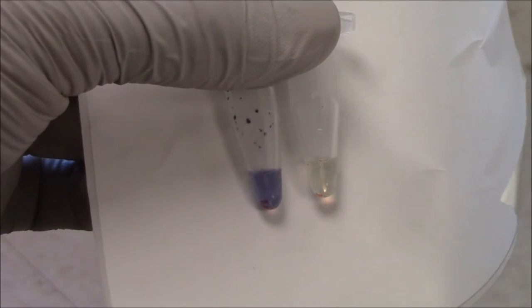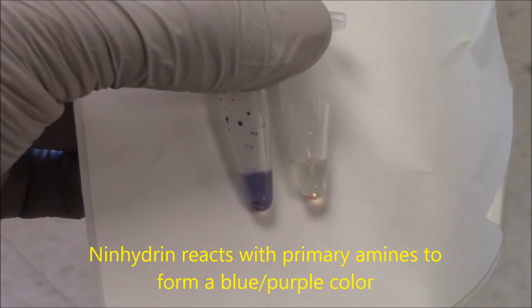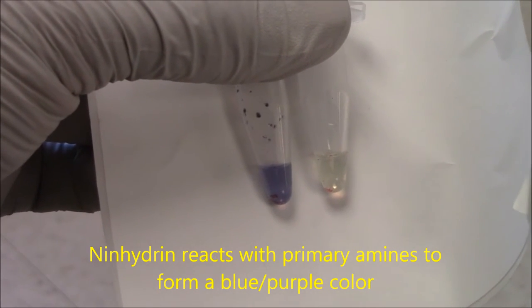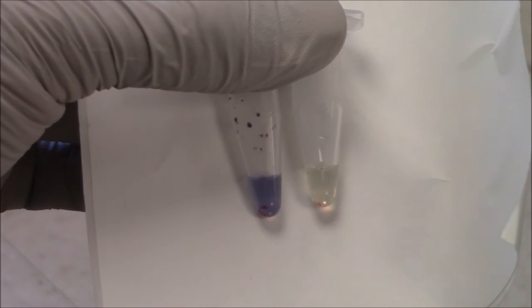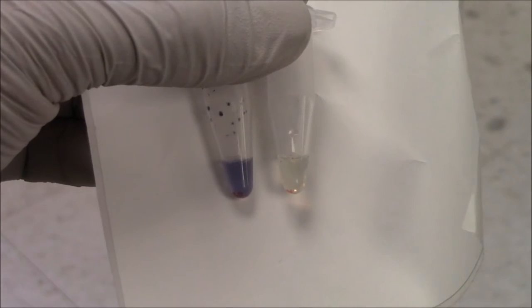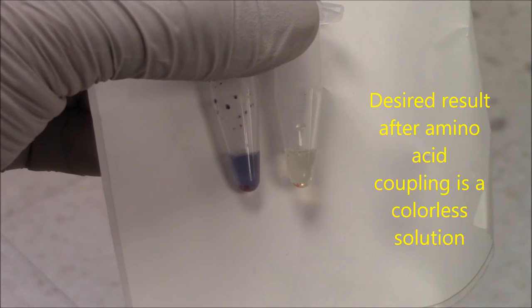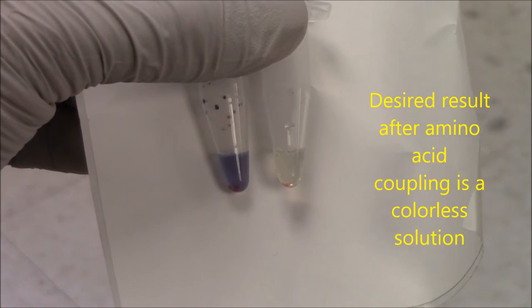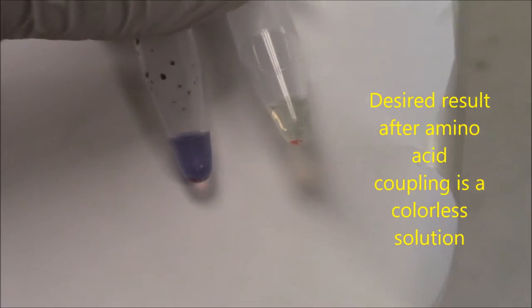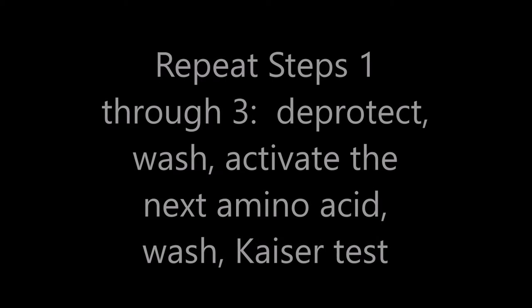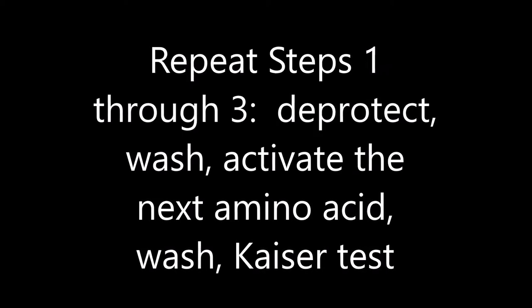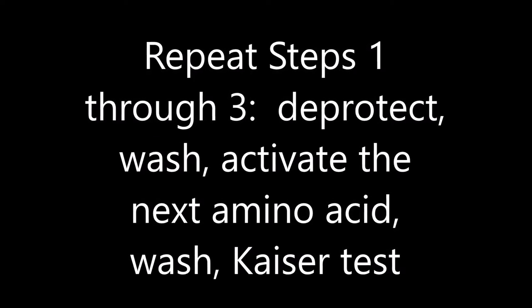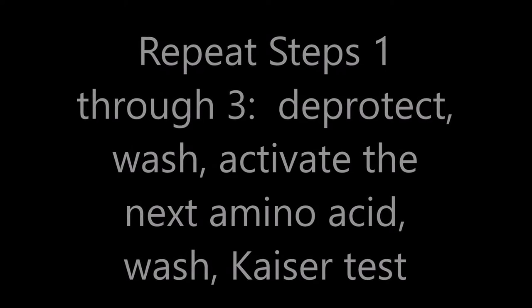Here are Kaiser test results in Eppendorf tubes. On the left are deprotected beads. On the right are protected beads. So easy to see the difference. If the activated amino acid has reacted well with the beads, then I expect to get the result on the right, the colorless result. Because all the amines have reacted with F-moc amino acids. There are no free amines to react with ninhydrin. After I've verified a successful Kaiser test, it's back to deprotection, spectral analysis, activate the next amino acid, Kaiser test that one, repeat.